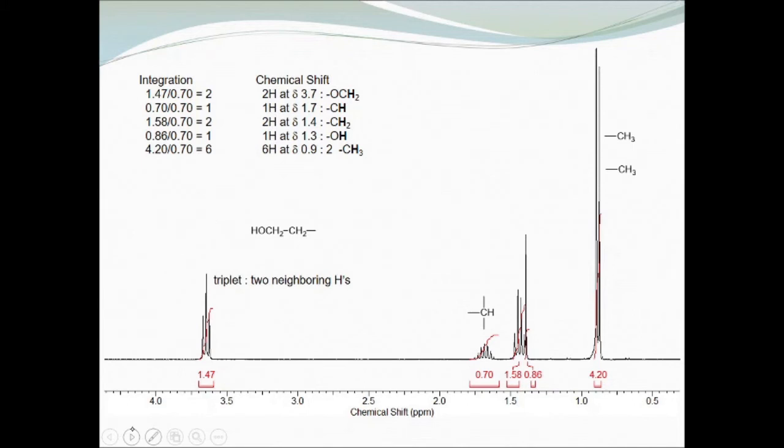And so now we have this fragment. Of course, we always want to double check our work. So here, this is the CH2 we just added. This is a quartet. Quartet means that there are 3 neighboring hydrogens. So if we look at what we actually have, we have 2 neighboring hydrogens. It's supposed to have 3, which would mean it's bonded to 1 more.